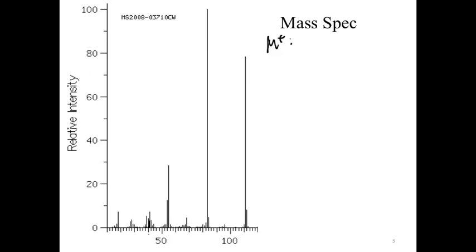Geez, that's pretty awful. Let me pause here for a second so I can think about it. Sorry, I just had to figure out exactly how they marked these. They've got these marked very, very oddly on this spectrum. We've got 25 here and then 12.5, so they went up by fractions. A bit silly, but that's the way it works.